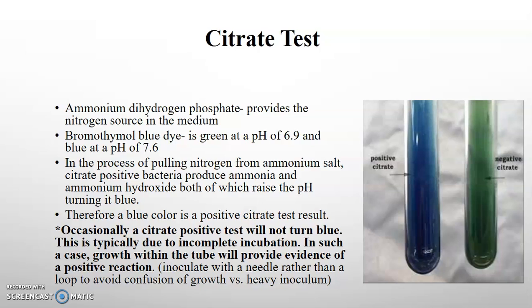So just keep in mind, green is negative unless there's growth, whereas blue is positive.